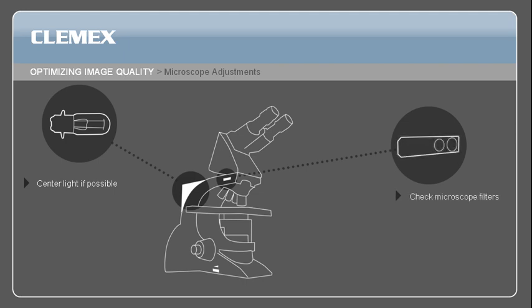Do this before creating the shading corrector. Adjust the light intensity on the microscope to about halfway using the illumination knob. Do not move the setting after the shading correction.